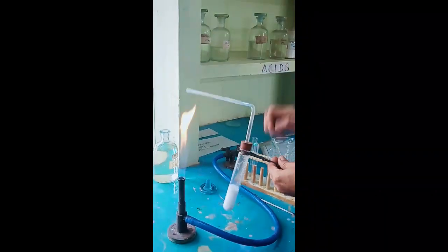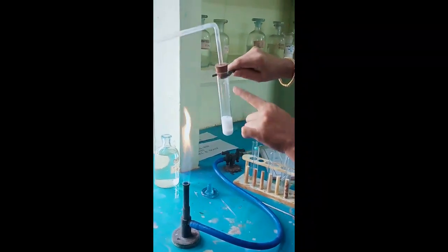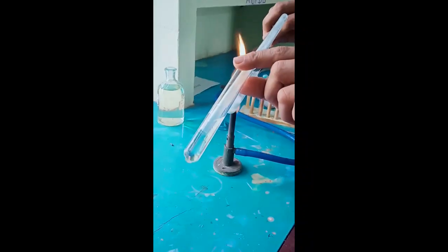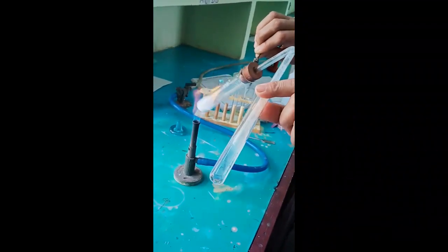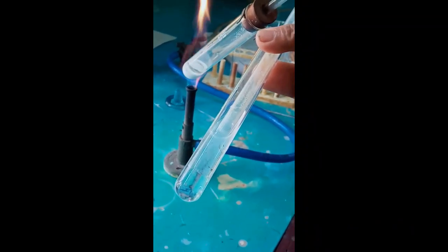On passing the gas through lime water, which gas is evolved? Carbon dioxide. Carbon dioxide is a colorless gas, and this is lime water. Lime water is colorless. On passing the gas through lime water, what do you observe? This lime water turns milky. Gradually the colorless lime water turns milky. Can you see? On passing carbon dioxide, lime water turns milky.